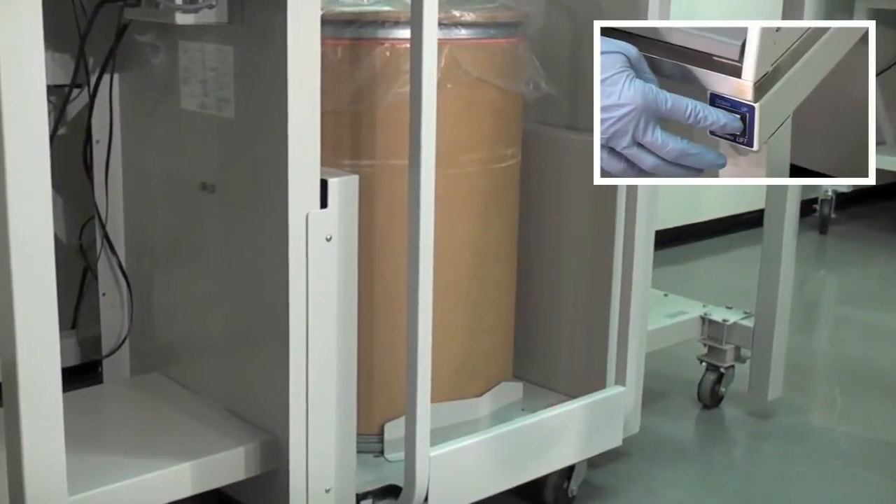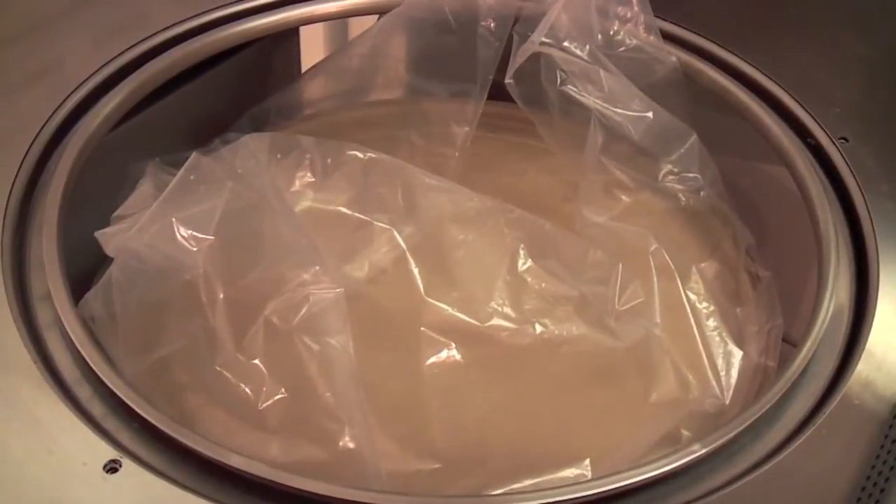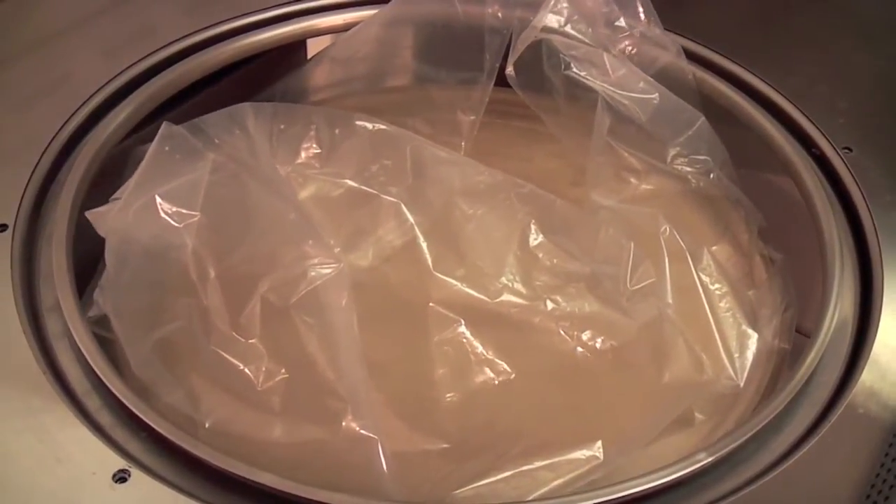Using the electric lift switch, raise the source container. The enclosure has an electric eye that automatically stops the lift when the container has reached the ergonomic working height.